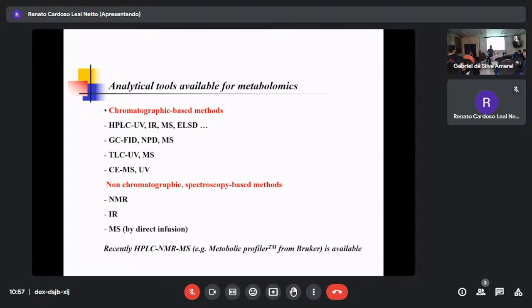Before NMR measurement, IR is used for the chemical fingerprint, to tell whether this is the expected structure or not. If you compare IR and it is exactly the same, then the compound is the same. But with UV, some different compounds have the same UV. NMR is sometimes close to IR, but NMR is still sometimes a problem. Mass is even worse, but IR is still reliable. So that's why they use this for metabolic fingerprinting, and mass spectrometry with direct infusion.